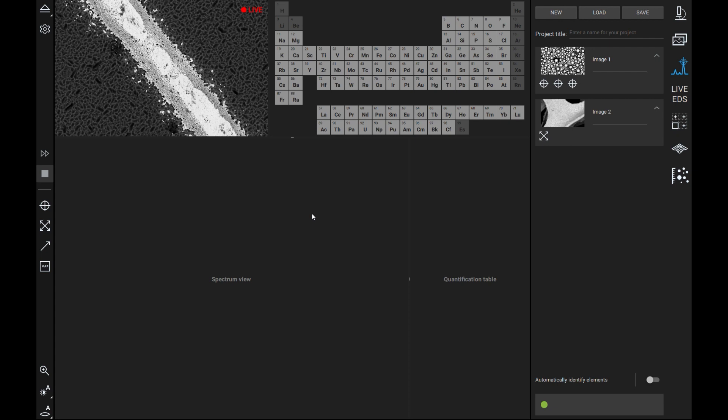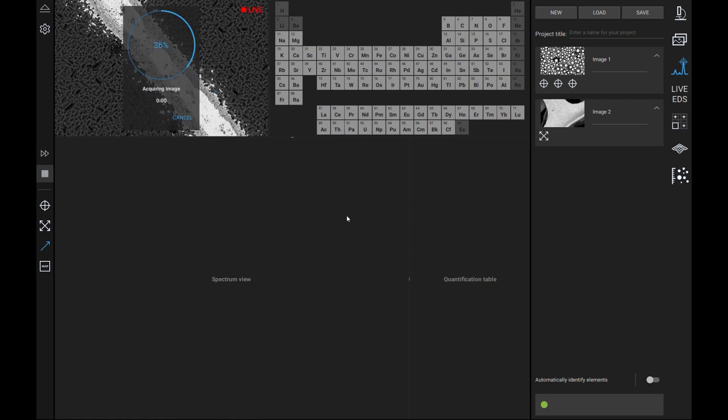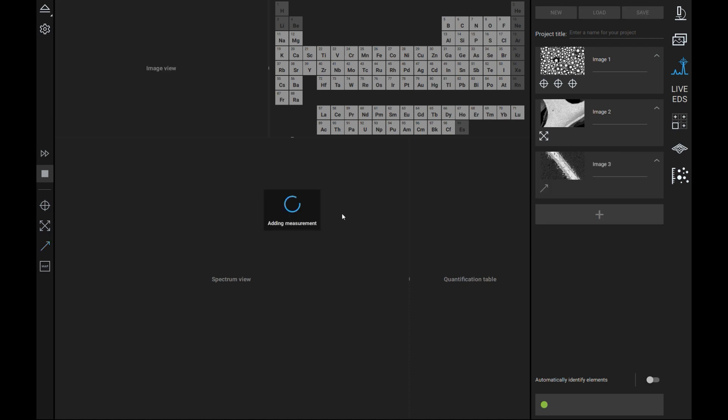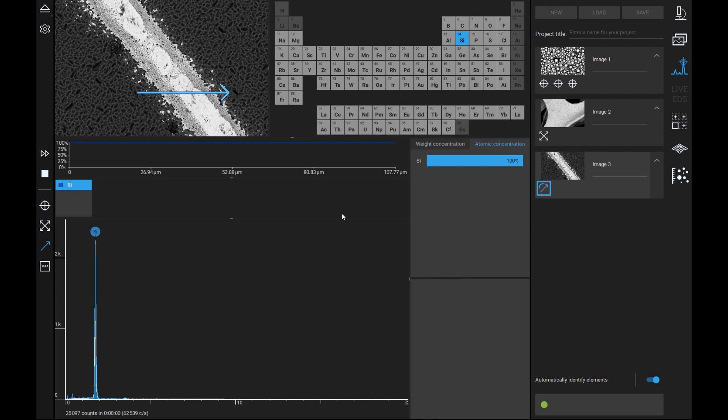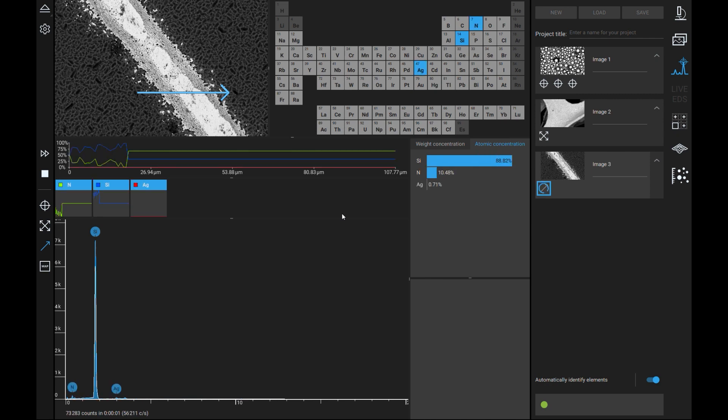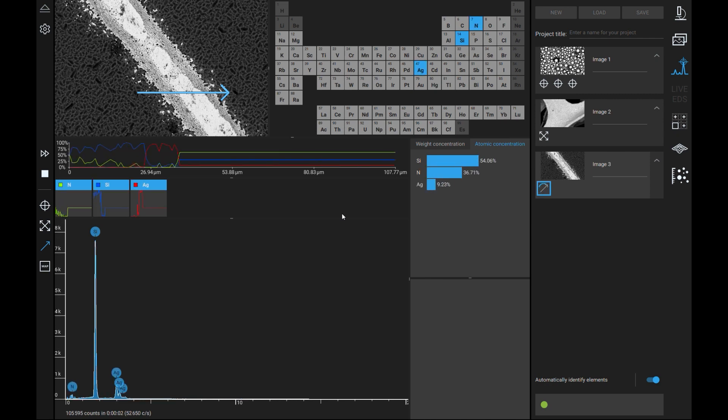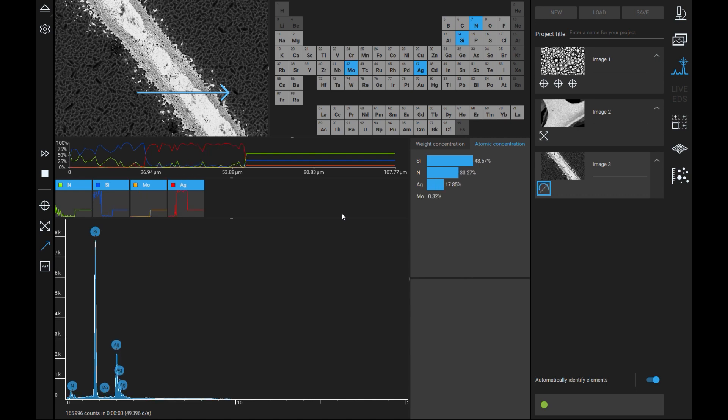EDS line scan is slightly different from the previous two analyses as it has the capability to visually show the change in elemental composition across a designated line. By selecting the line icon on the left the user can draw a straight line across the image by left clicking and dragging. Once drawn the electron beam will then pass over that line and the software will display both the ratio of each identified element in the form of a line graph and the overall spectra.